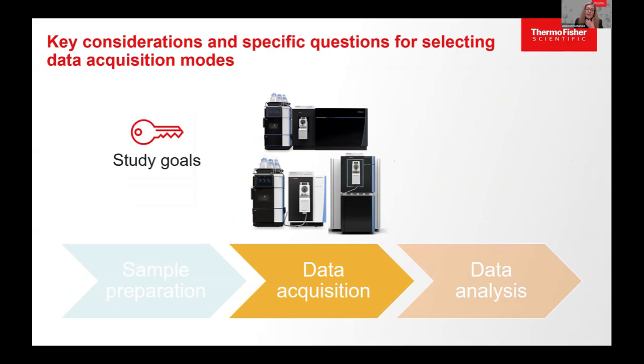And when it comes to the data acquisition, again, it's really important whether your goal is ID or your goal is quantification, because you can always tune the method toward one way, right? I saw Mike was mentioning how many points per peak he has on the DIA.